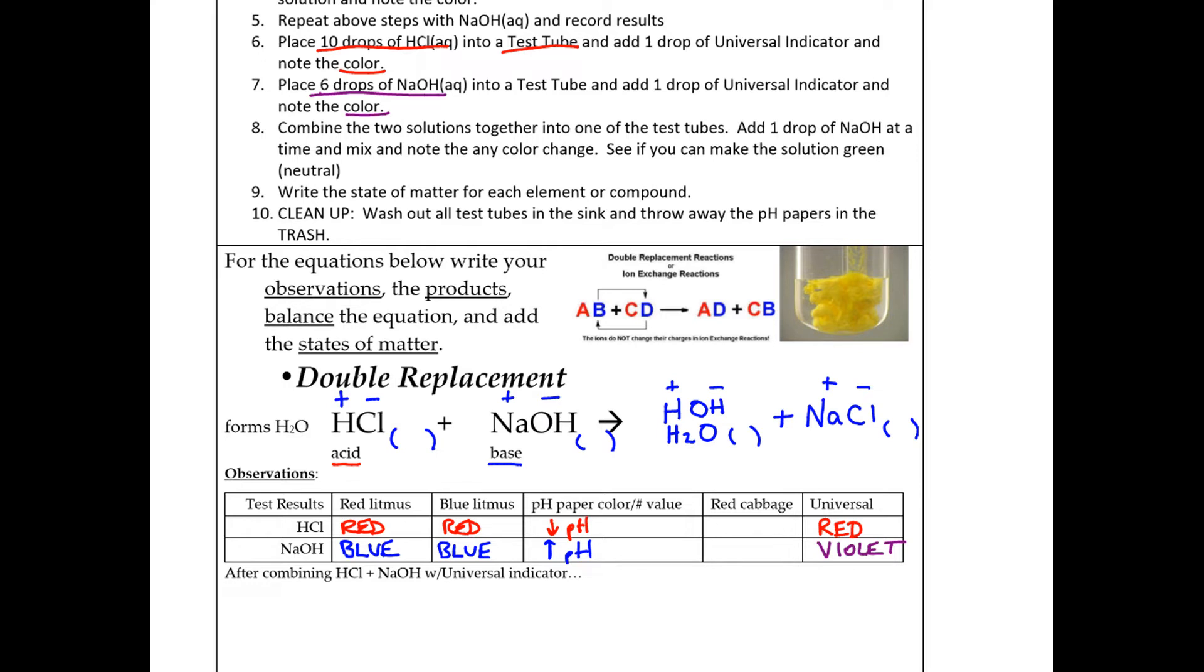And we are actually setting the stage for our next chapter, which is on stoichiometry, which answers the question, how much? But for now, you should understand that a one to one ratio means you would need equal amounts of HCl and NaOH to react. But you'll notice that we only had 10 drops of this, but we only had six drops of this. So we had less NaOH, and they have the same concentration. They're both about one molar.